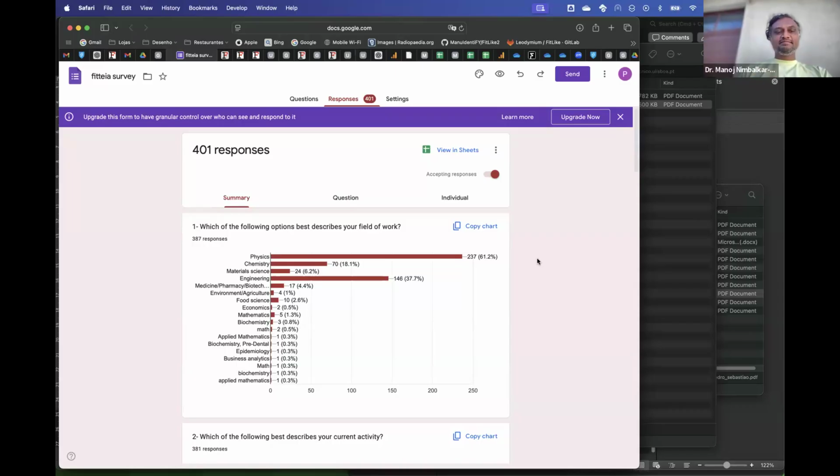Yeah. For fitting a straight line, you don't need it. But if you have to fit a multi-peak spectra, or paramagnetic relaxation enhancement with magnetic nanoparticles together with polymers and something like that, then immediately you face a problem that you have to spend a lot of time developing your own software to do it, because it is as it is. And so in that case, it is helpful. So that is what is shipped in the fitting engine. Yes.